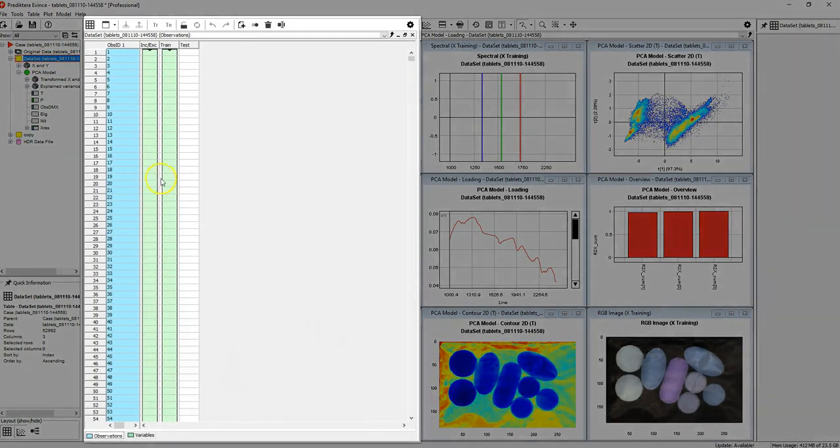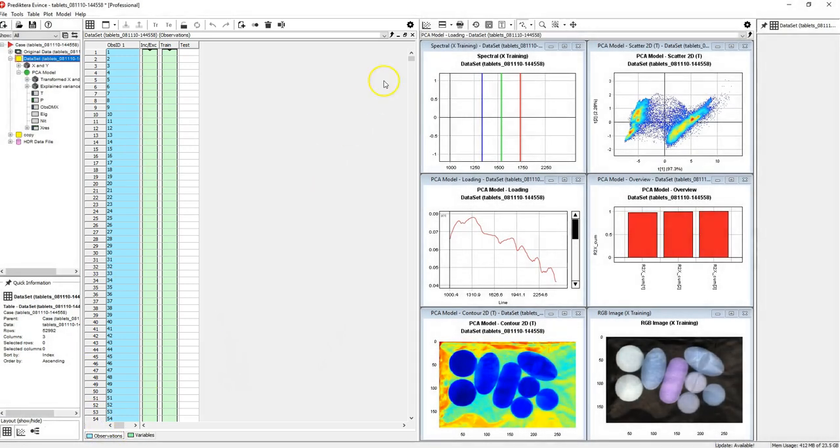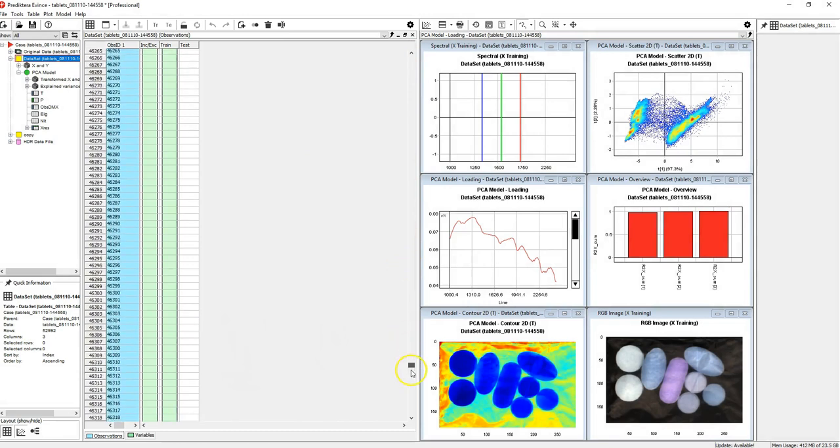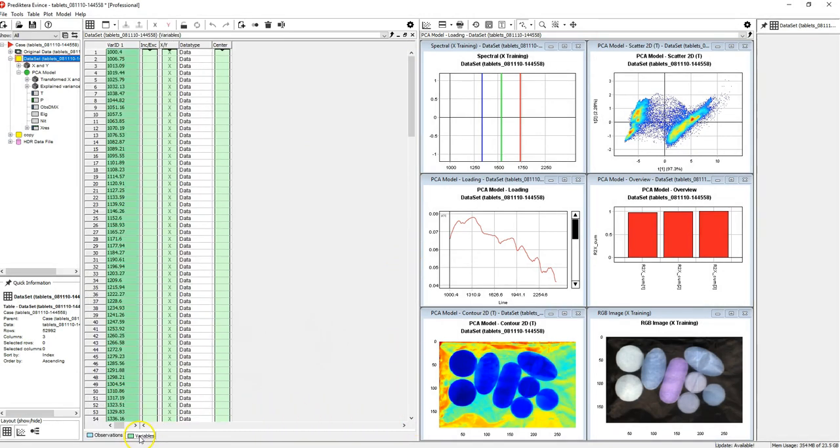The table area shows information in the form of tables. In this case we have a list of observations or pixels in our dataset, and a list of our variables.